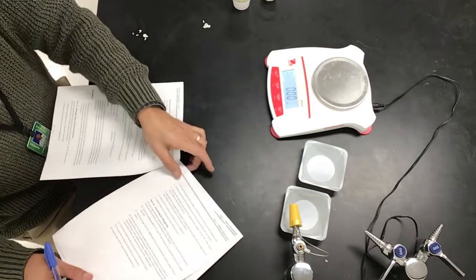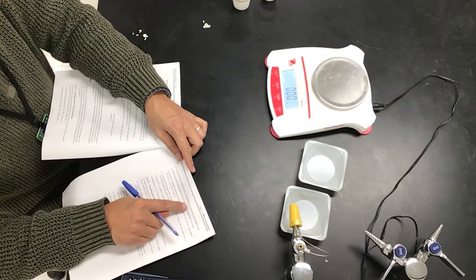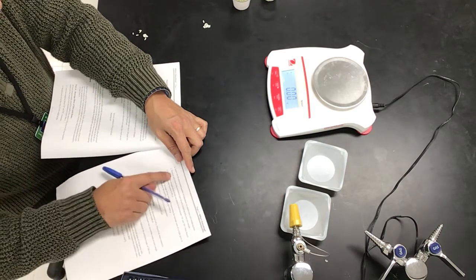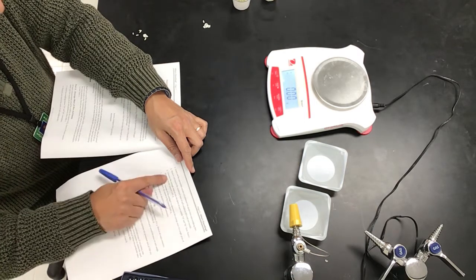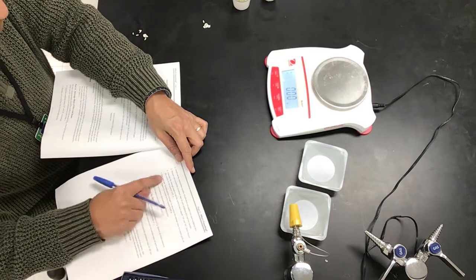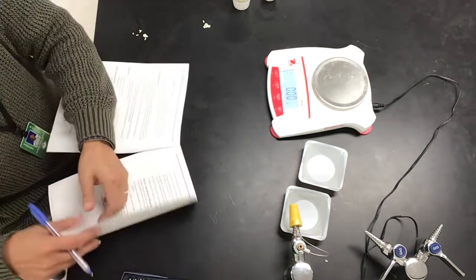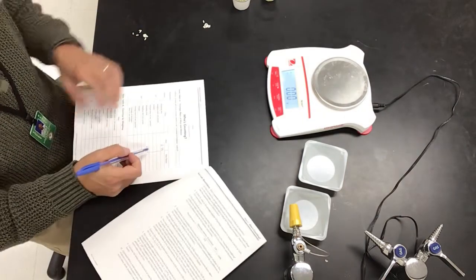So now, 4 says, count out the appropriate numbers of individual rice grains into each weighing dish. Measure and record the combined mass of each weighing dish and the rice sample. Calculate the average mass of 1 rice grain for each sample, 10 and 20. Report the result to the nearest 0.001. Our scale can only go to 2 digits, so we're going to do our best there.